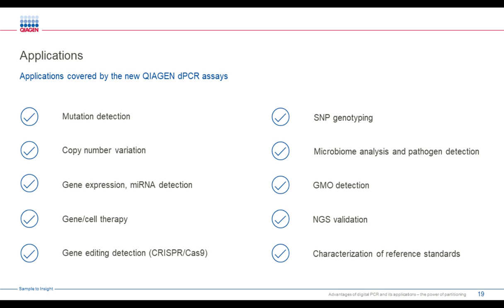But I would perhaps say mutation detection, yes, but more like rare event detection, because when you have something rare that you are looking for, that can be anything basically. It can be a virus. You can look for invasive species like environmental DNA or ancient DNA, something that you just can't find with a normal standard qPCR or a normal standard endpoint PCR today.